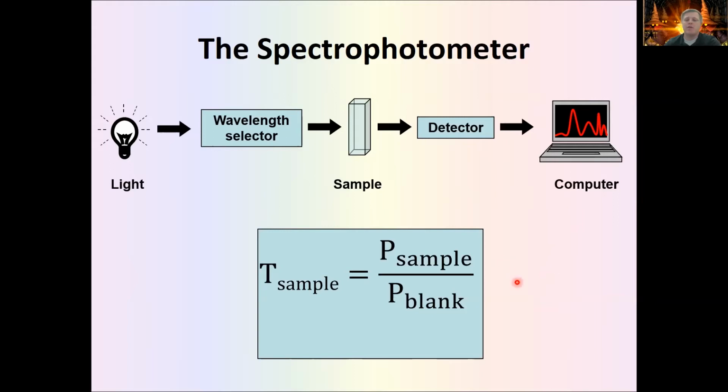The next value we're going to be interested in is the absorbance. We're interested in the absorbance, of course, because it has a linear dependence on concentration, as we saw in Beer's law. So the absorbance is just calculated as the negative log of T. Some of you might be thinking, we do a lot of negative logs in this lab.